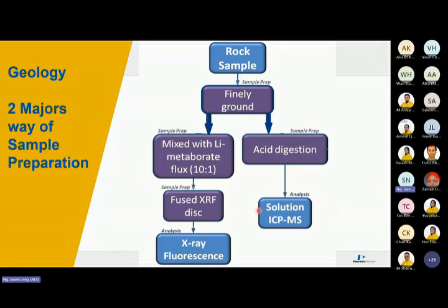At this time, ICP-MS receives the dry aerosol. Like just now, it's a good introduction because you already have some concept. So the laser will be our autosampler. You know, you have a very expensive autosampler. When you couple laser ICP-MS, the ICP-MS is cheaper than the laser. That means your laser is much more expensive compared to ICP-MS.